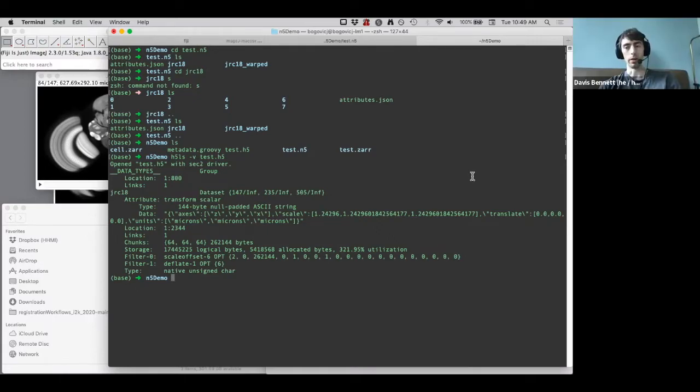But if the dominant format is JSON, then for some people, well, whatever the spec decides. If the spec is using JSON, then dumping a blob of string into here is identical. And that's precisely what we did with this H5 thing.